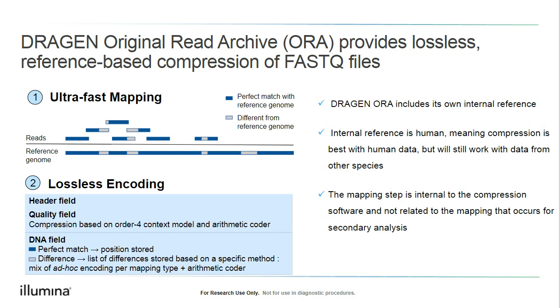The mapping step that is done as part of the ORA compression is internal to the compression software, as I said. So this is completely different from the mapping that you're familiar with as part of your secondary analysis.